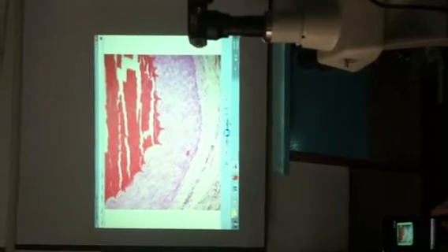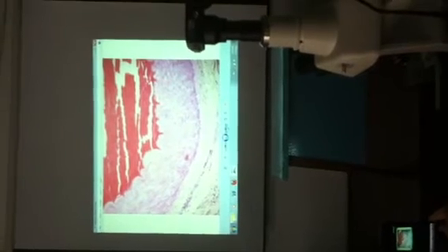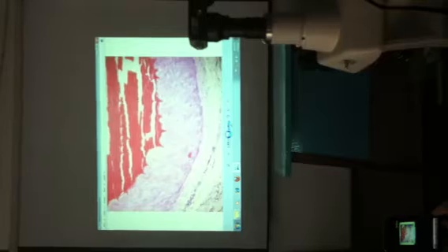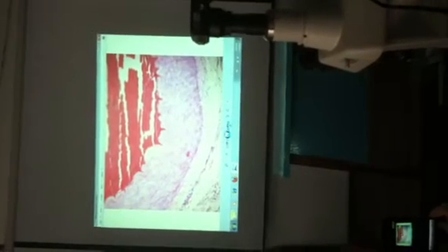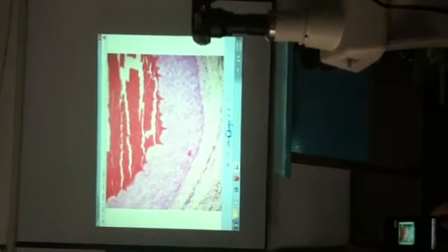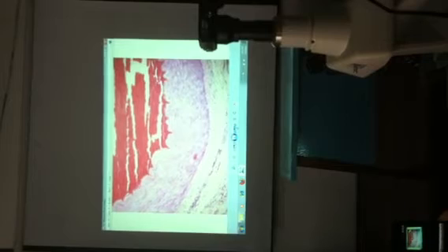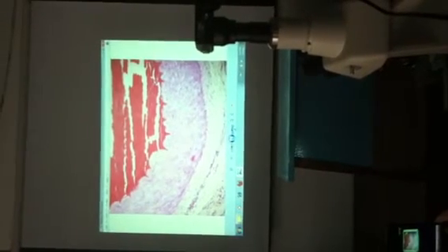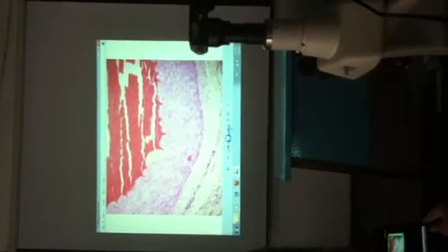The specimen is a blood vessel. This is a blood vessel. We are not asking you to draw the entire blood vessel. You'll go to that under circulatory system. Okay, all we are asking you to draw is the epithelium. This is now simple squamous epithelium, that one, in side view or on edge.